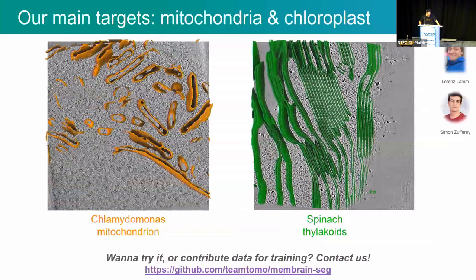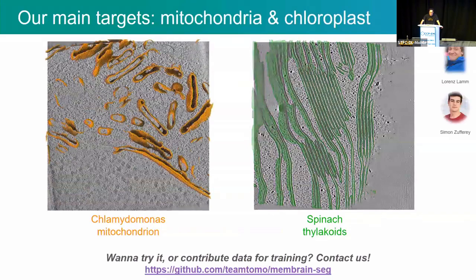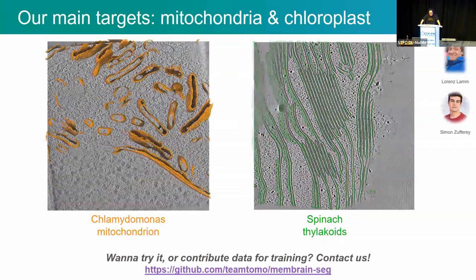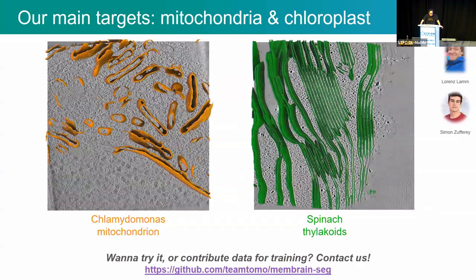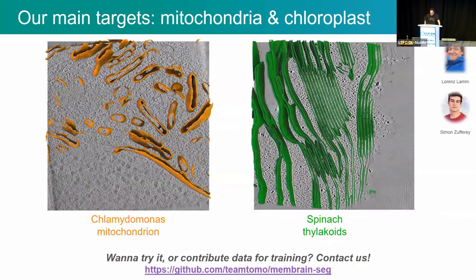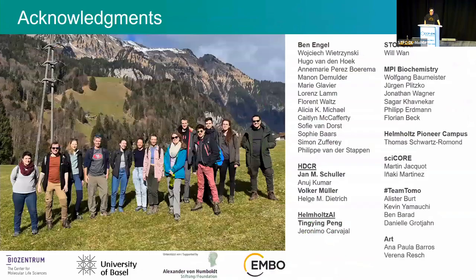All these segmentations were done with MemBrain-seg, which will be part of MemBrain version 2. And like I said, if you want to try it or contribute data for training, please get in touch with us.